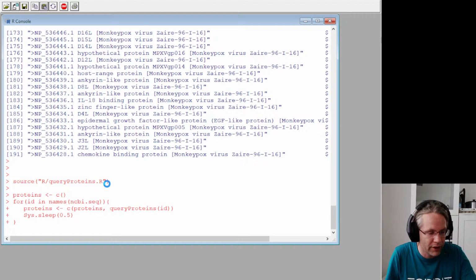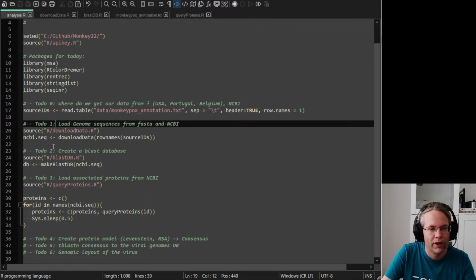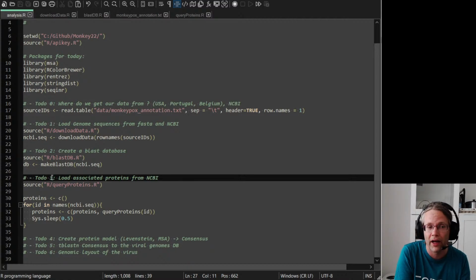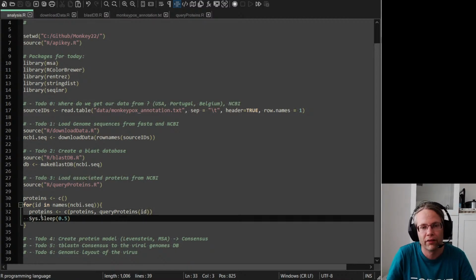If we look at the code so far, we did to-do 0, 1, 2, and 3. So we're kind of halfway through what I wanted to show you to do a real kind of analysis. And of course, all of these things are in the R course. All of these tips and tricks, like using grep or lapply or apply, you learn those when you do the R course, I think after lecture number 5. All right, very good.